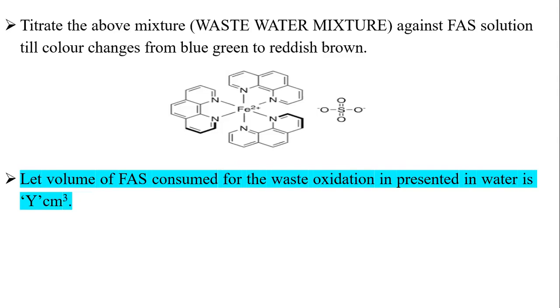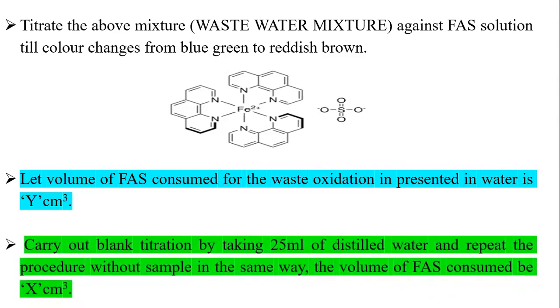How much volume of burette reading will be consumed? Y cm cube. This Y cm cube is the FAS consumed for what purpose? For the purpose of waste oxidation, the waste oxidation present in water. How much volume will be consumed in the blank? You can take it and carry out a blank titration.